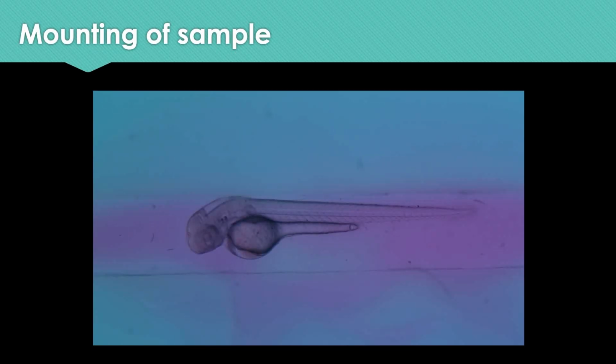The zebrafish larva can stay like this for up to 24 hours in this mounting style, and this can easily be used to image the trunk, the retina or the eye region, the cardiac region, or the tail fin region as well. In normal conditions, the methylene blue and phenol red are not used within the agar, meaning they are completely transparent.